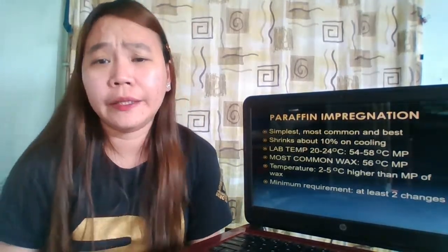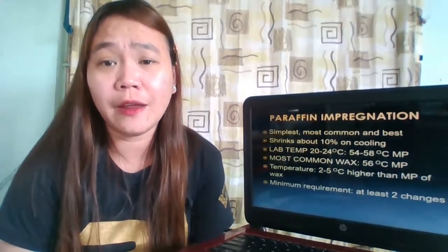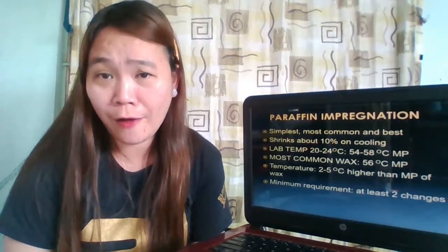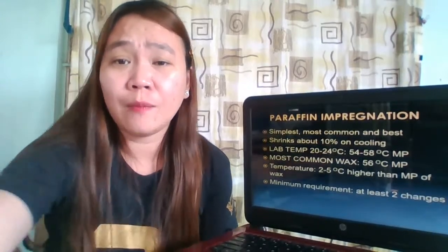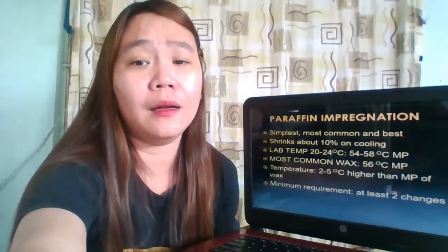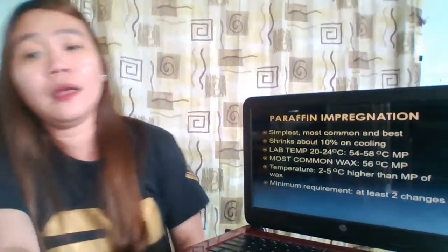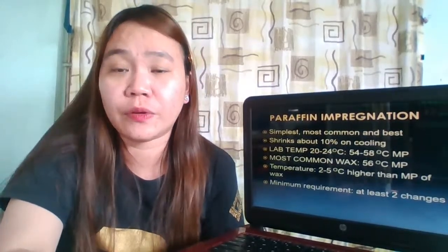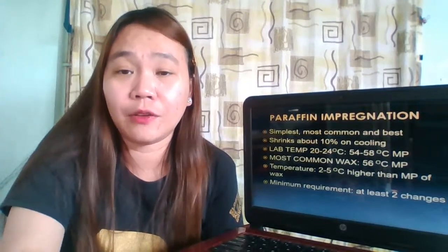Yes, actually that's the hard part whenever I discuss impregnation and embedding. You have to memorize a lot of temperatures since the melting point is really a very important characteristic in this case. I'm sorry, but you have to memorize a lot of temperatures in here. Yes, a lot of temperatures.